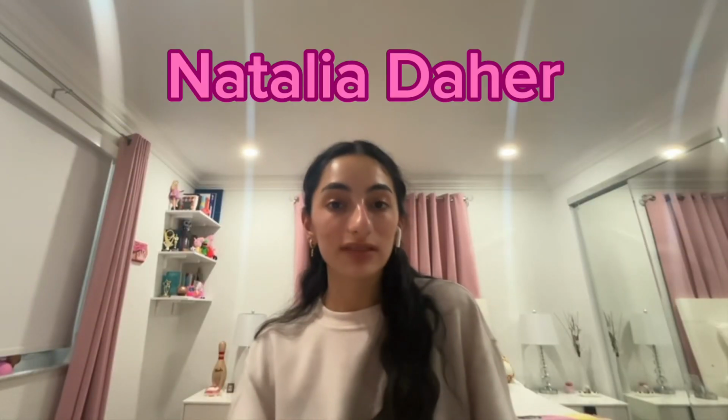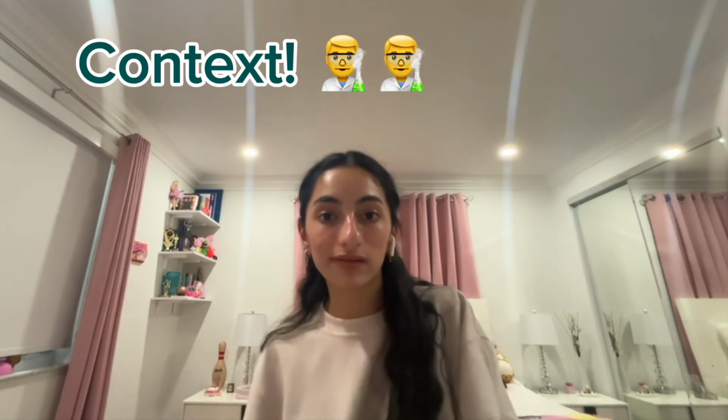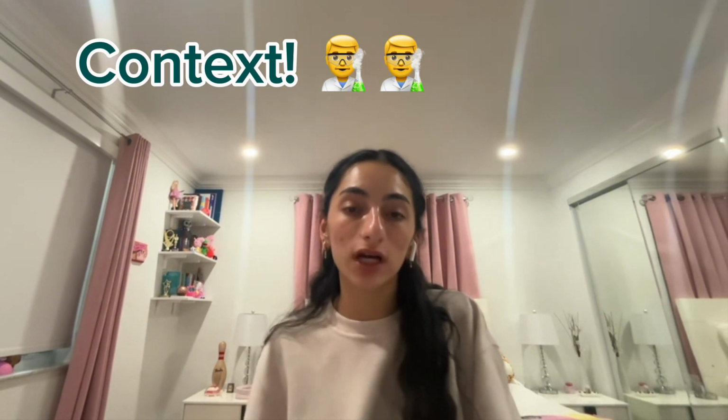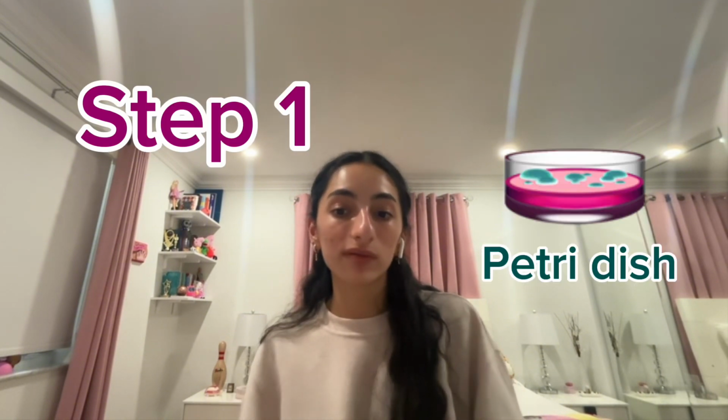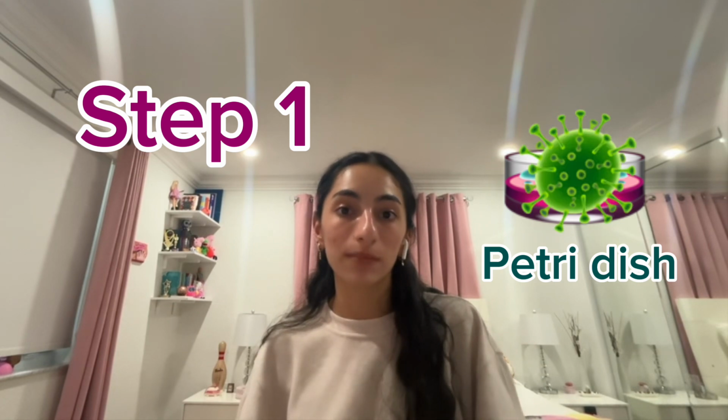Hi, my name is Natalia Daher, and for this project I will be answering how the Kirby-Bauer test works. For a little bit of context, the Kirby-Bauer test is an experiment done to determine how reactive or how sensitive a bacteria is to an antibacterial. We do this so that physicians and scientists are able to develop new antibiotics that can help fight different diseases and different bacteria. So in order to do this experiment, the first thing you're going to need is a little circular plate that contains your bacteria. So for example, E. coli.